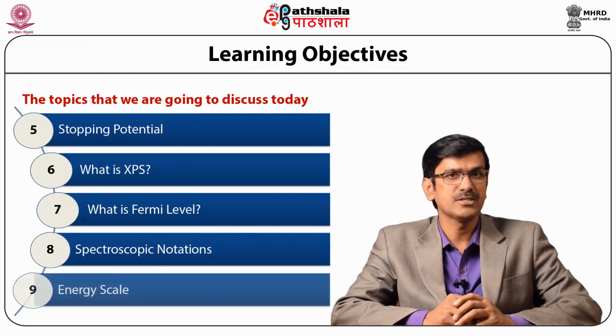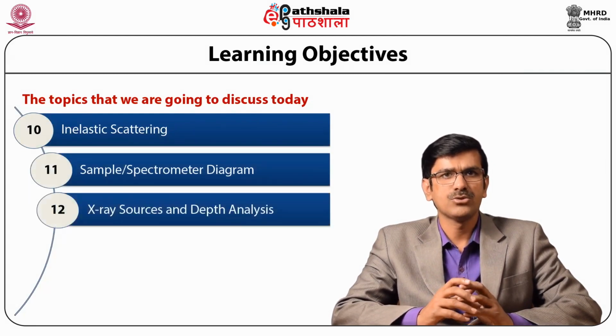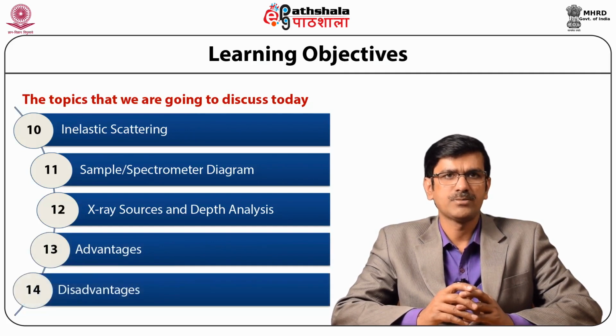We will discuss energy scale, inelastic scattering, sample spectrometer diagram, X-ray source and depth analysis, and at the end we will discuss the advantages and disadvantages of XPS.